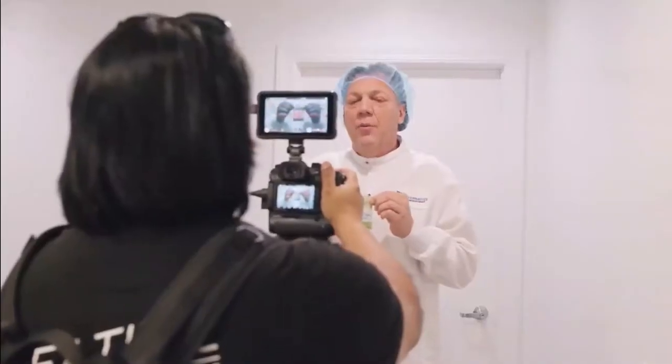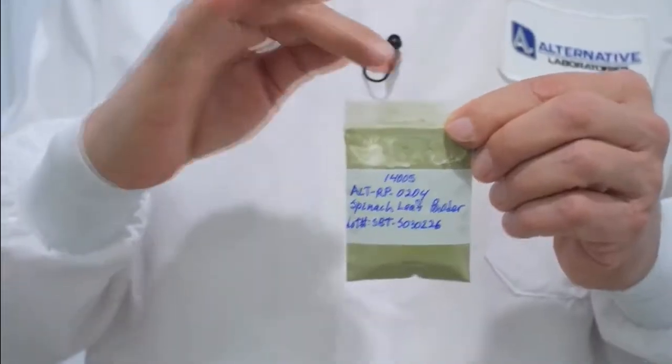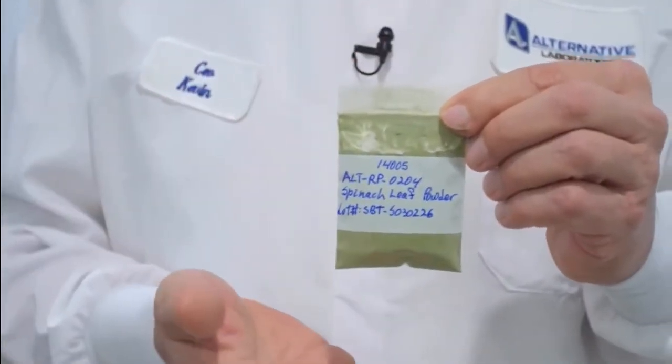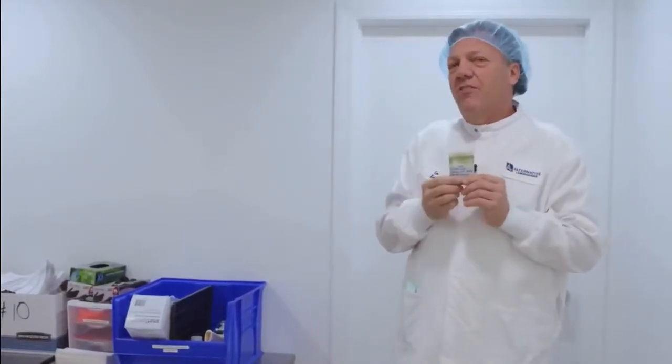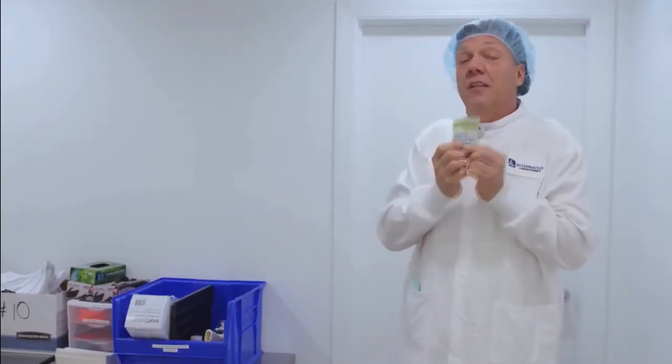When the raw materials are received by the company, the big, large bags are brought over to this clean room, sampling room, where we can pull small samples, and these small samples go into the microbiological room for purity, potency, and is this really fit for human consumption? Is this fit for our uses? So you have to have sanitary environments where you do all of these samplings, and it starts right here.